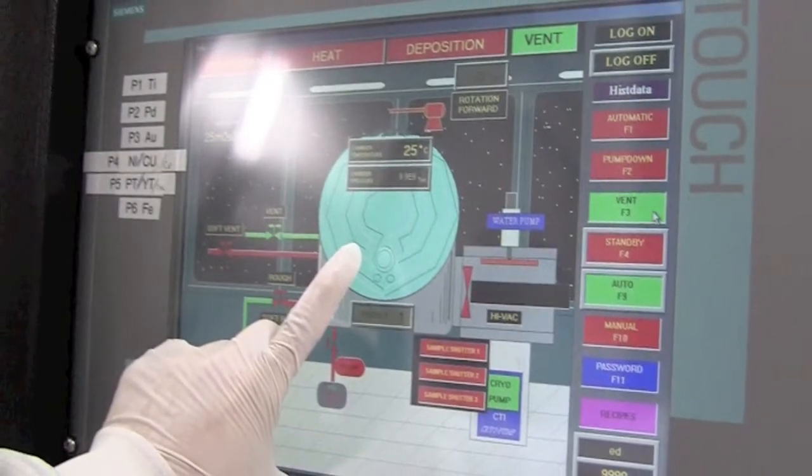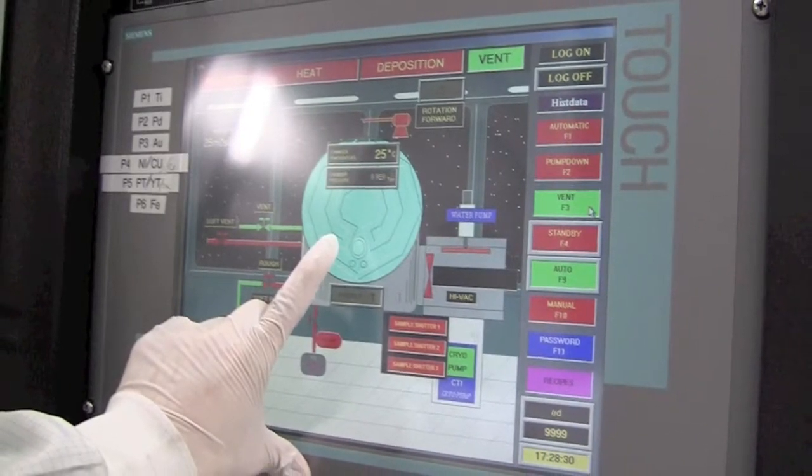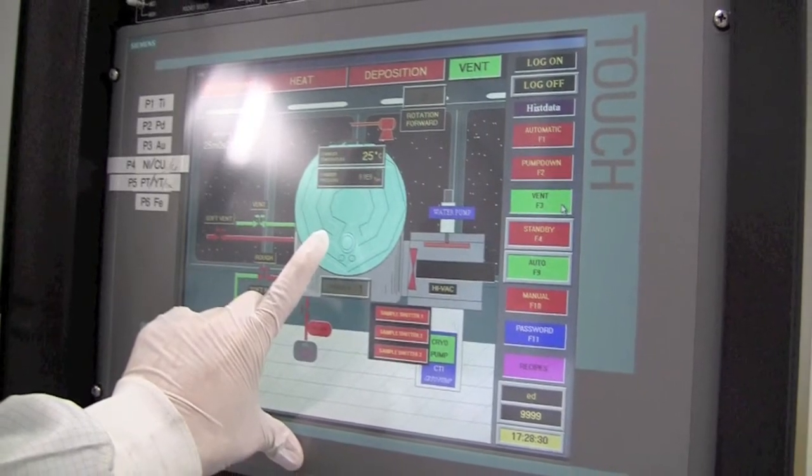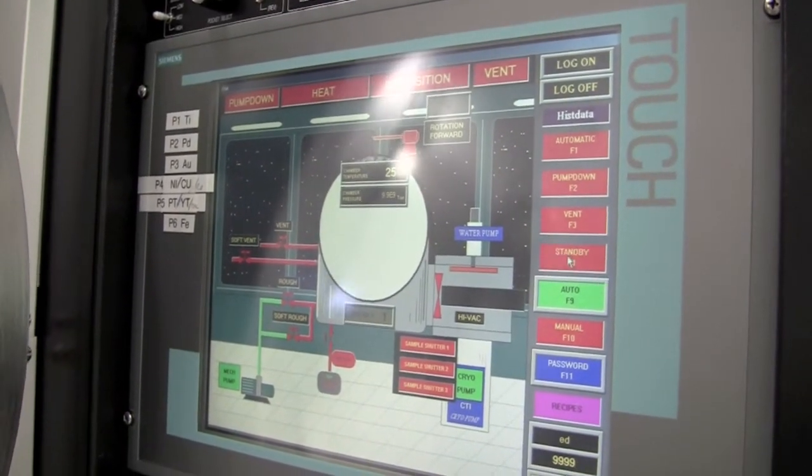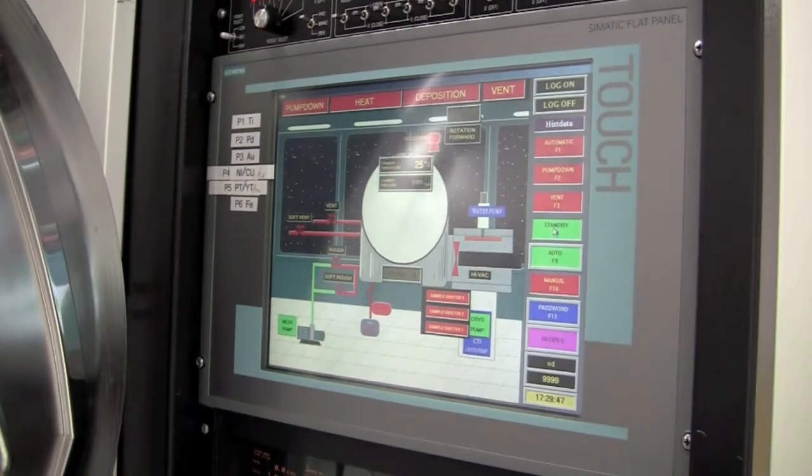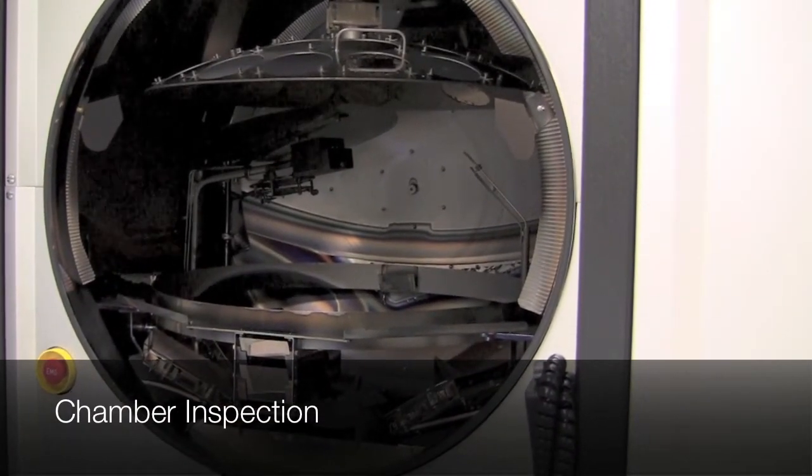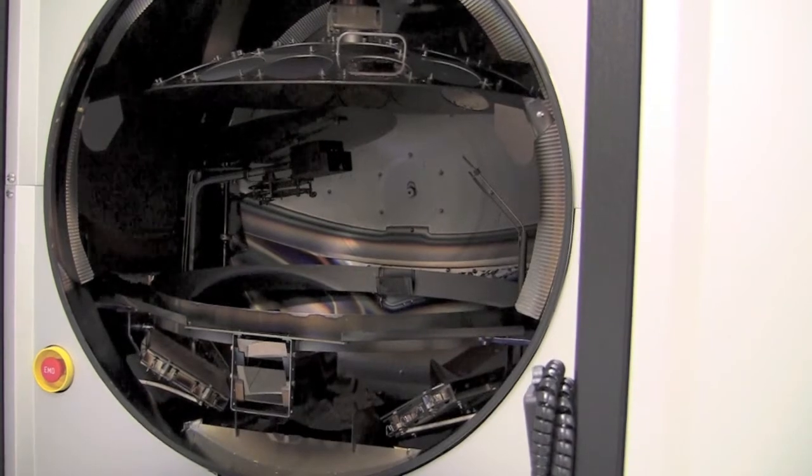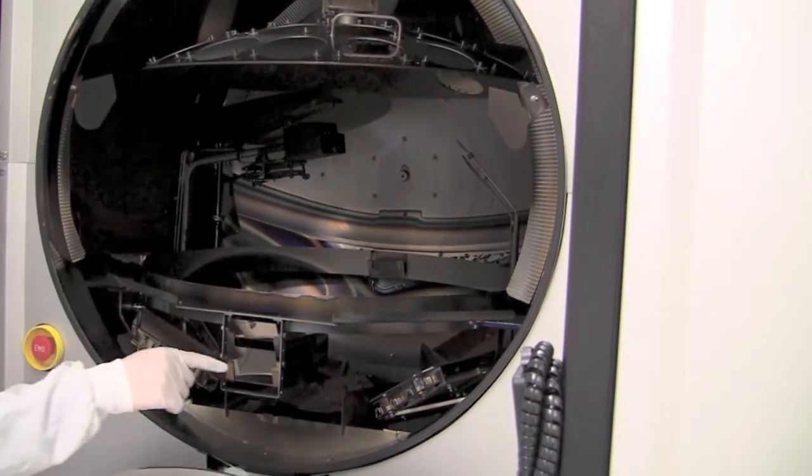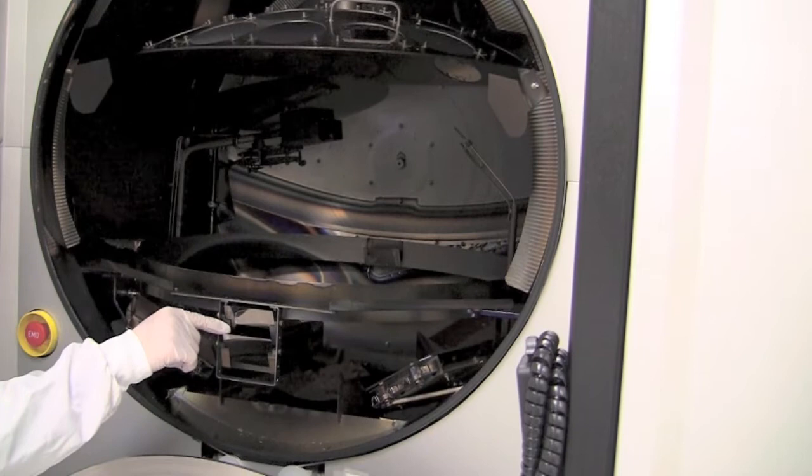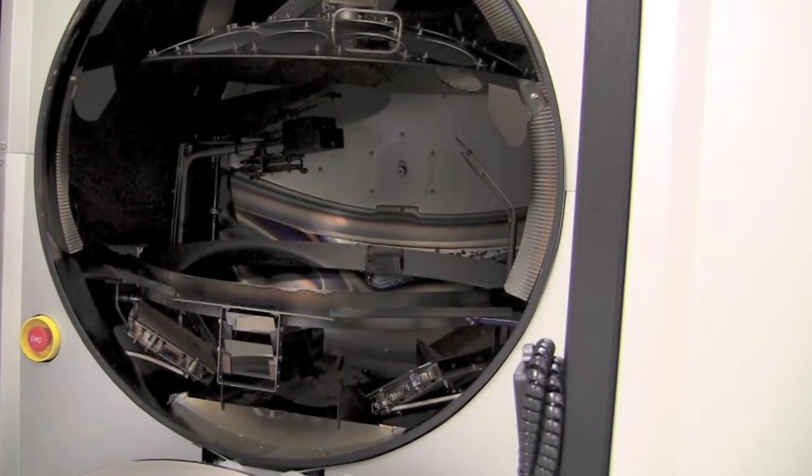Now we can see from the graphical user interface that the chamber is full of purged nitrogen. Now that the chamber is back to atmospheric pressure we can open the chamber door. After doing so we push standby and that will stop the venting. We can pull the door out and pull the door down. Once the chamber door is open it's a good idea to inspect the condition of the chamber, to make sure there's nothing obstructing the crystal monitor, there's no metal flakes peeling off. We also want to check that the glass slides are transparent in order for us to monitor the electron beam during deposition. If there are any issues with the chamber please check with staff.